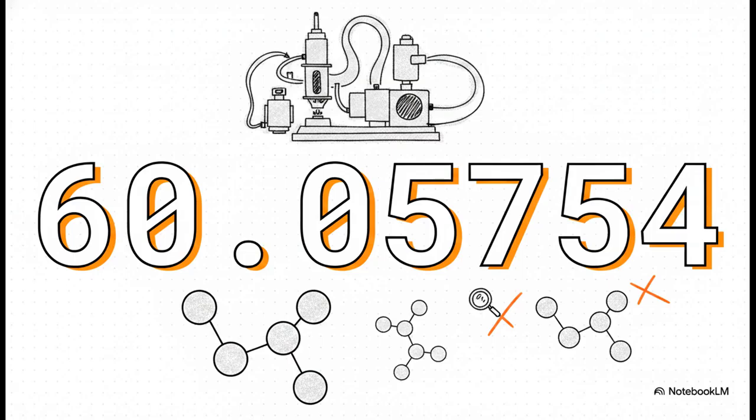When we do that, we don't just get a simple 60.1, boom, we get 60.05754. This instrument acts like a highly calibrated molecular scale that gives us pinpoint precision down to 5 decimal places. By matching this incredibly exact number to our list of suspects, we can definitively prove that our molecule is, for sure, C3H8O. The other formulas, they just simply don't match those decimal points.